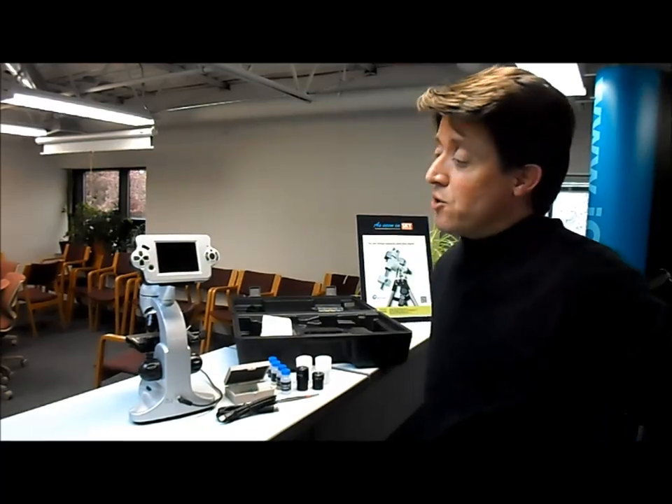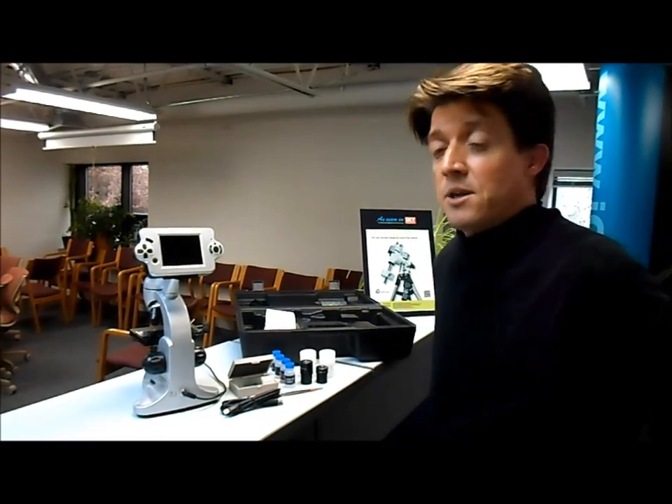Hi, I'm Coleman with Ioptron Telescopes and Microscopes, and I'm here today to talk to you about the Ioptron ST640 Digital Microscope with 3.5-inch LCD screen.